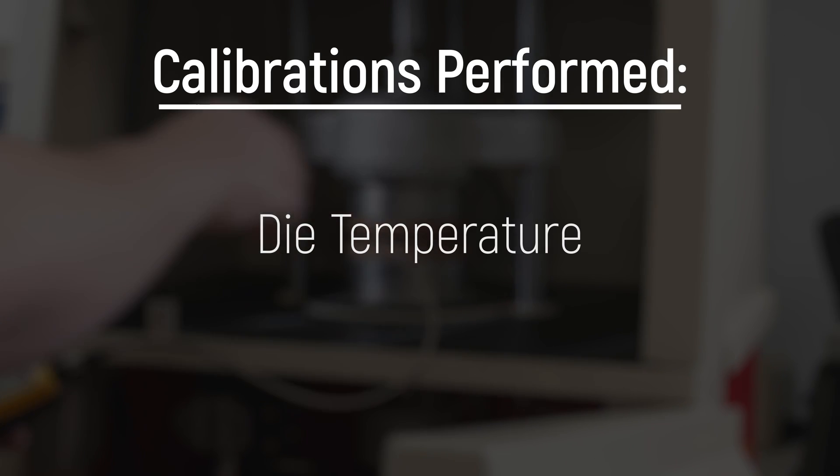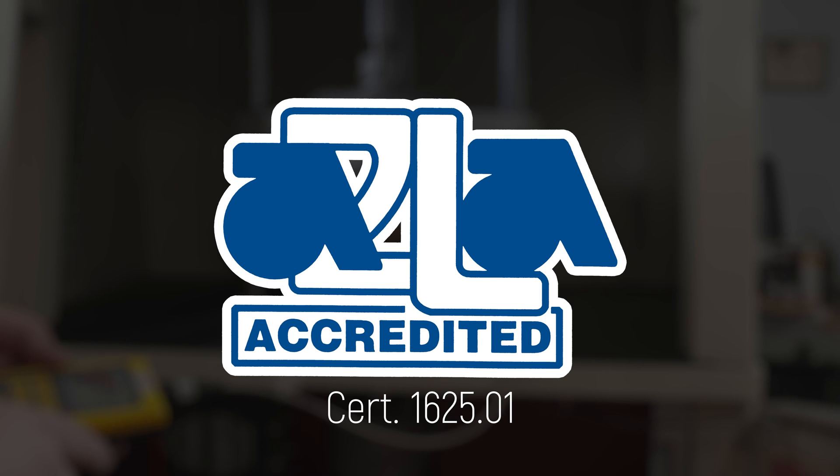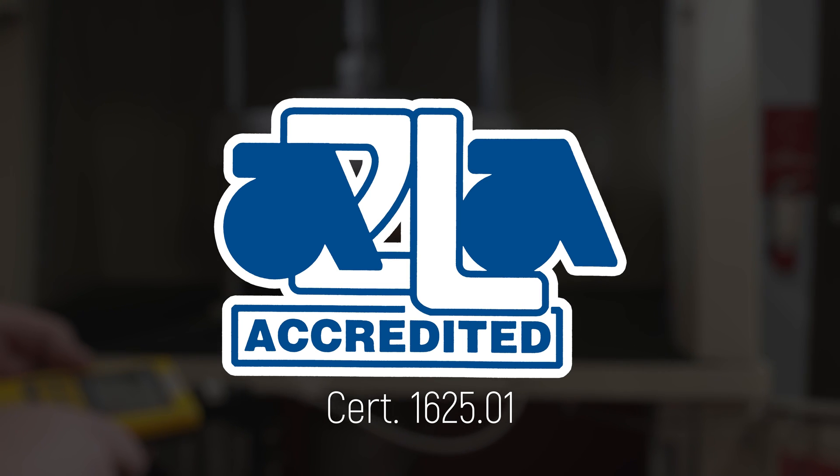After rebuilding, we calibrate the closing force, die temperature, torque sensor and die gap to the ASTM, providing an ISO 17025 accredited calibration for all measurements.